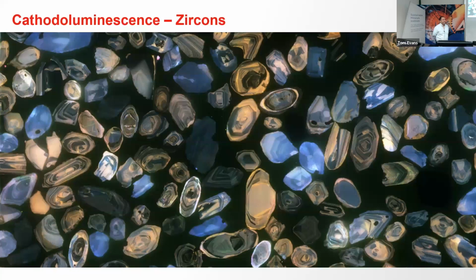Hi, Leonardo. Thank you for the talk. Really interesting. I just have three questions. Do you think it's necessary to still do a mineralogical validation with other analysis? Especially because traditionally automated mineralogy is validated with XRD. Also, in the case of the cobalt and iron peaks, the differentiation on the EDS, are you working with other electron energy levels just to differentiate those elements? And also, with which commercial laboratories are you working in Australia?